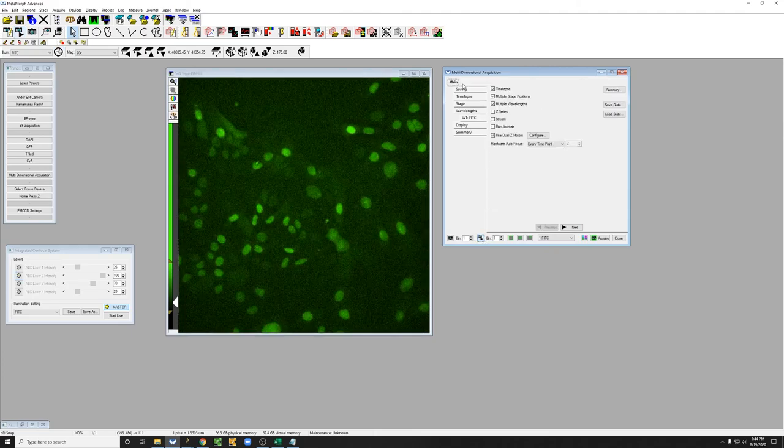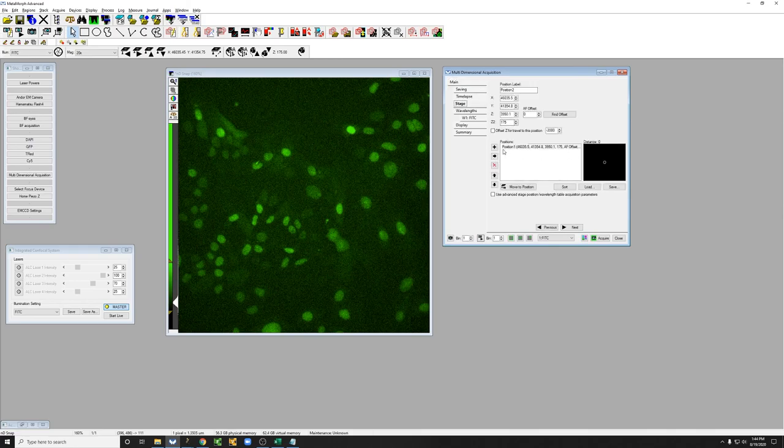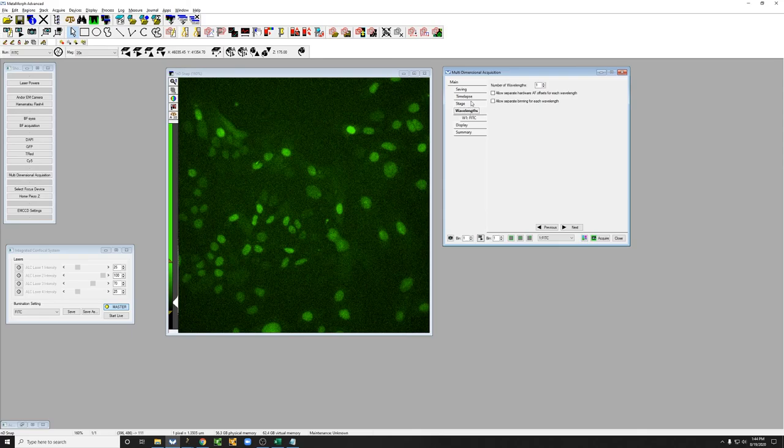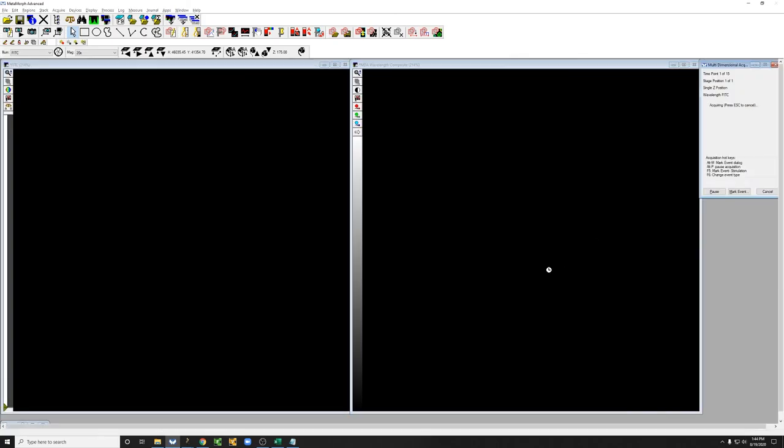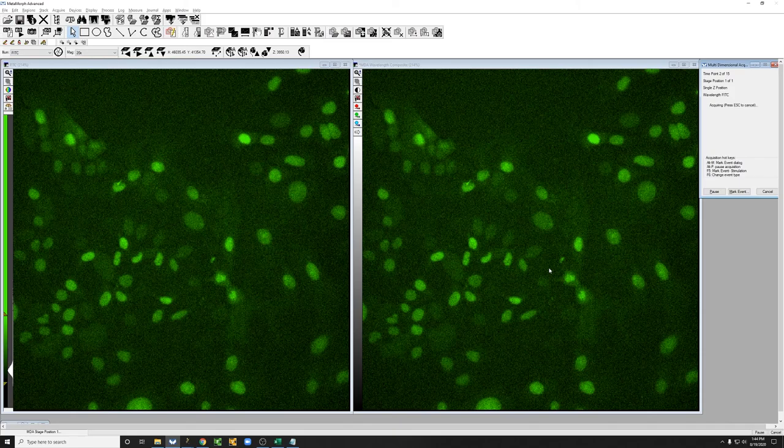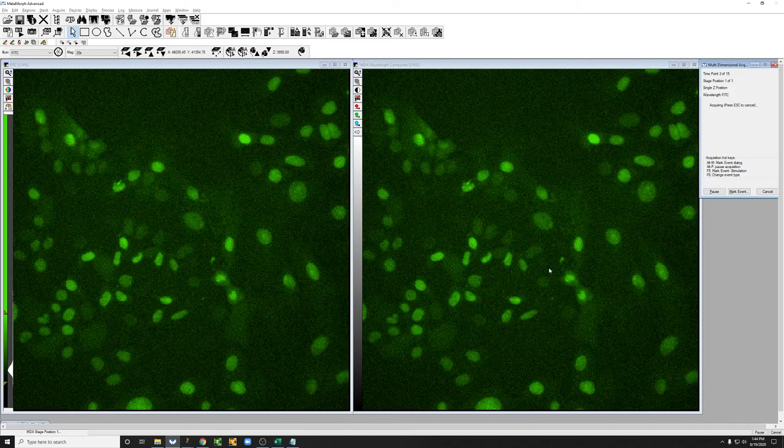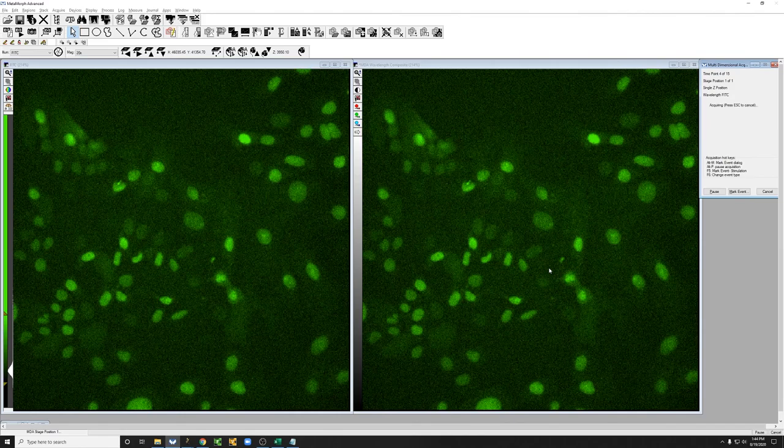So now that we have a time lapse, the multiple stage positions with just this position set up, the wavelengths is ready, the time lapse is ready, and if you look at main we've turned on the hardware autofocus for every time point. When we hit acquire, what's going to happen is before every single time point the autofocus is going to find the cells and then allow the system to take an image, and every time it finds the cells it's going to beep, which is the beeping that perhaps you can hear in the background.